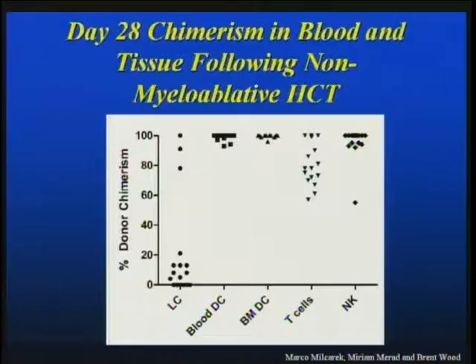So I'll go through a few complex cases in the lab that necessitate a little more cogitating on our part and a little more tweaking when it comes to looking at the analysis. The one that I just showed you previously, where it was 75% donor, that's one of the straightforward ones. But occasionally they're not as straightforward. So this is one example.